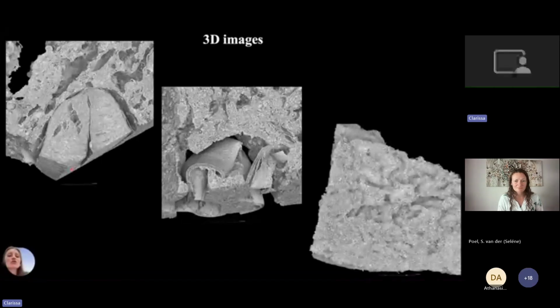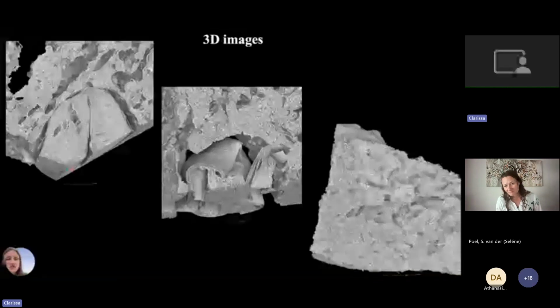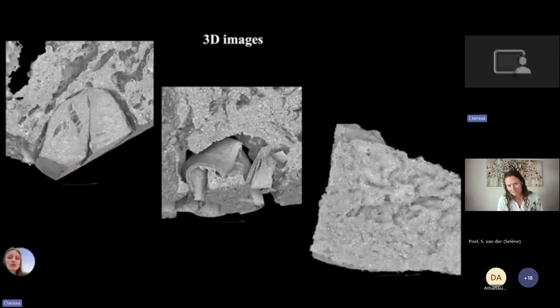It's a little bit more tricky once you look at these amorphous textures. This, for example, is a tamale made of manioc, and there's nothing really key or visible that you can see.